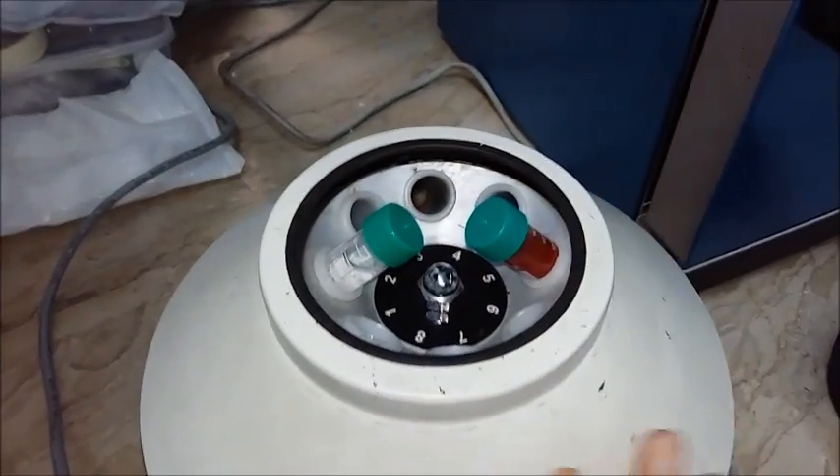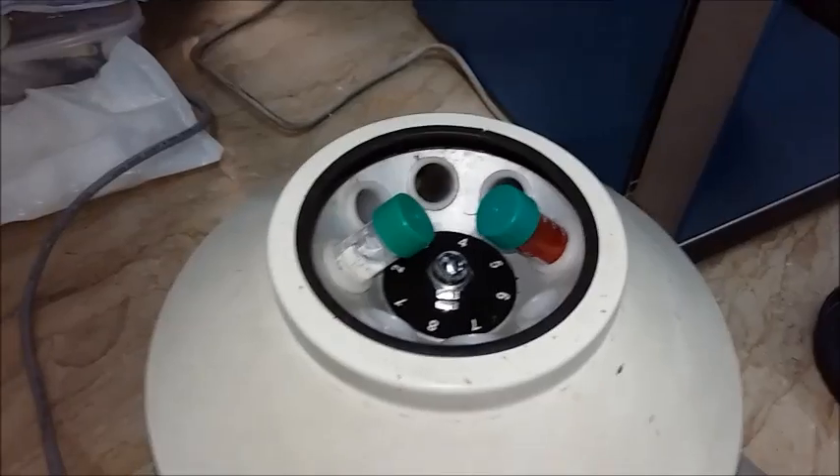We've put it in the centrifugation machine and now we're going to give it a spin — for how many minutes? 10 minutes.